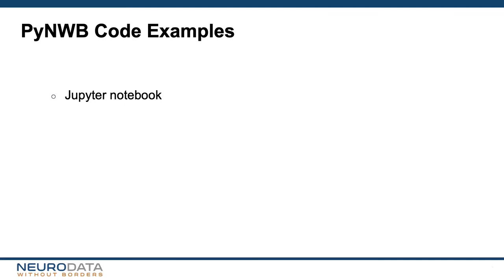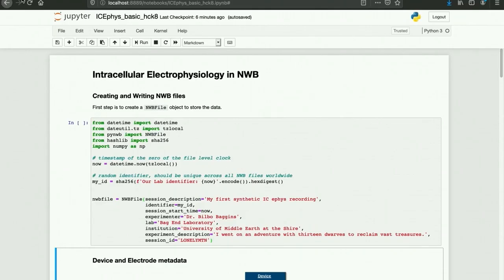Now we're going to take a look at some example code for creating NWB files in a Jupyter notebook using PyNWB. The first step is to create an NWB file object to store the data. We include a random identifier that uniquely identifies this NWB file. We also include other session-level metadata, including the session start time, as well as information about the experimenter, the lab, and the institution.